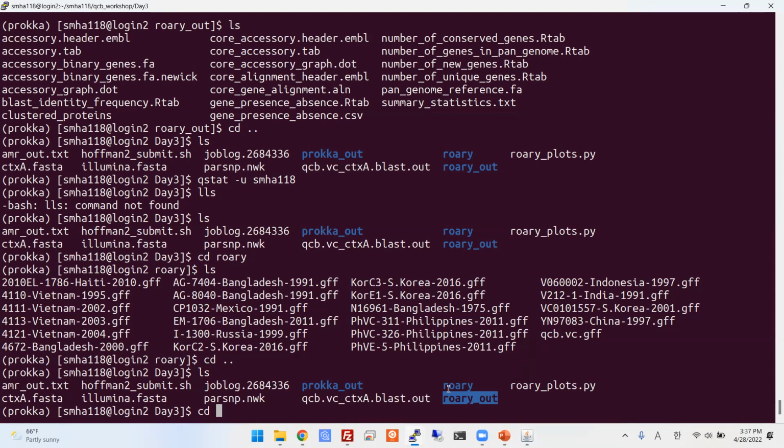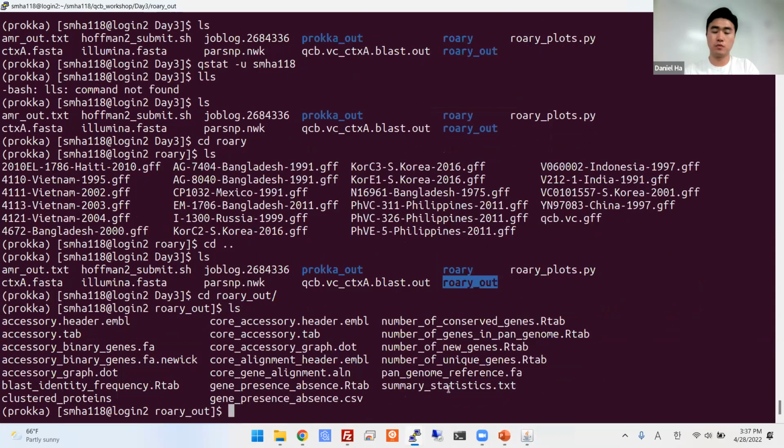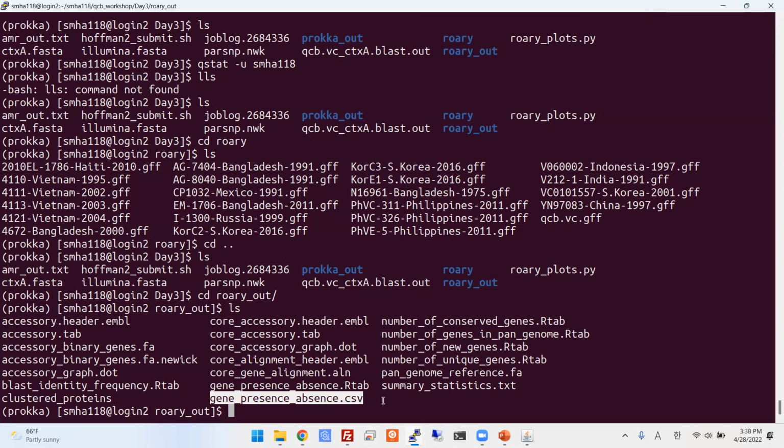I got the Roary output. Do you have the same content as mine? A bunch of accessory and core genes and stuff. Yeah. And you also need this gene presence and absence .csv. Yeah, I have that.